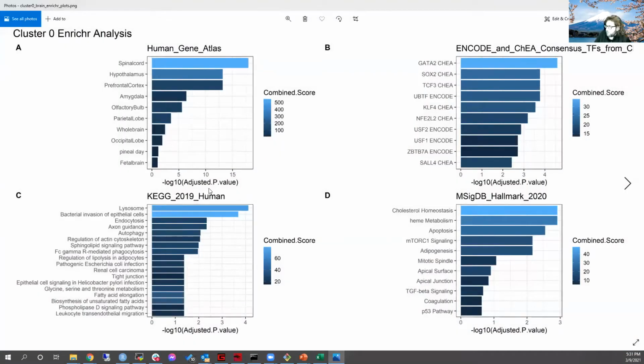Pretty cool stuff. So these were supposed to be neurons, these are supposed to be oligodendrocytes, if you recall. And if you actually go on Enrichr, it's very clear that you've got a strong oligodendrocyte identity in the enriched gene sets, but just none of them happen to occur in this particular grouping of 4 databases that we chose here.